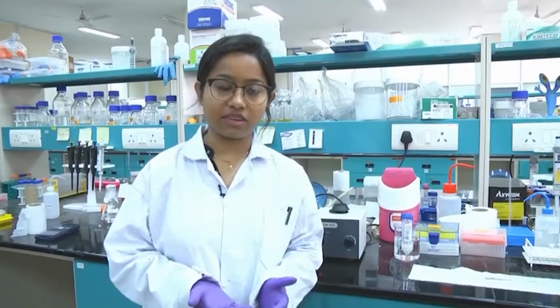Basically you grow your cells overnight, then you give a primary inoculum from that overnight culture to a large culture, suppose 1 liter of LB media, and you grow that 1 liter culture the next day for maybe 4 to 5 hours at 37 degrees centigrade, because E. coli mostly grows at 37 degrees centigrade and its life cycle is around 20 minutes. When the media reaches an OD of 0.6 to 0.8, you know you have enough bacterial cells and you can induce the culture with IPTG, and the bacteria will start producing the protein.